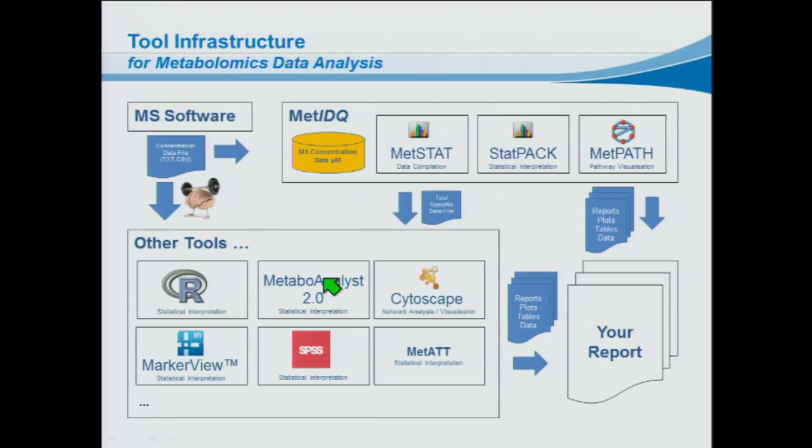So we have, for example, now integrated MetaboAnalyst text files. I mean, you can say, okay, it's just a text file, but to be honest, it is really a problem because everyone is always moving around data in text tables, and this takes so much time, and I think that's error-prone, and that should be done by software. And what we also have is an XML export file, and we have an R package with which you can then load the data from the XML file directly into R without needing any parser again.